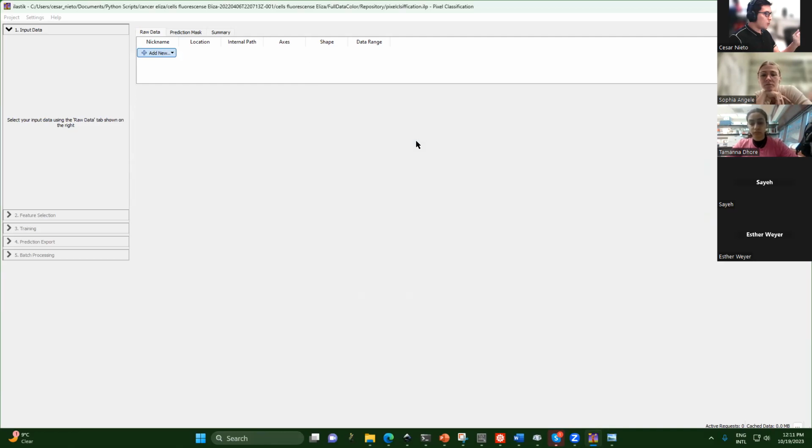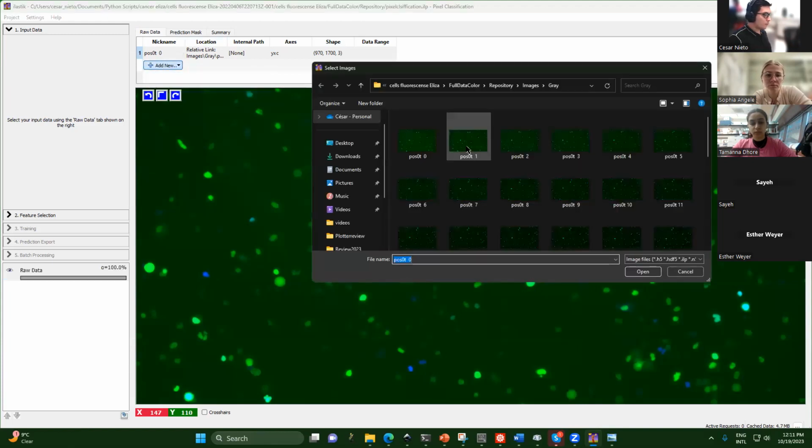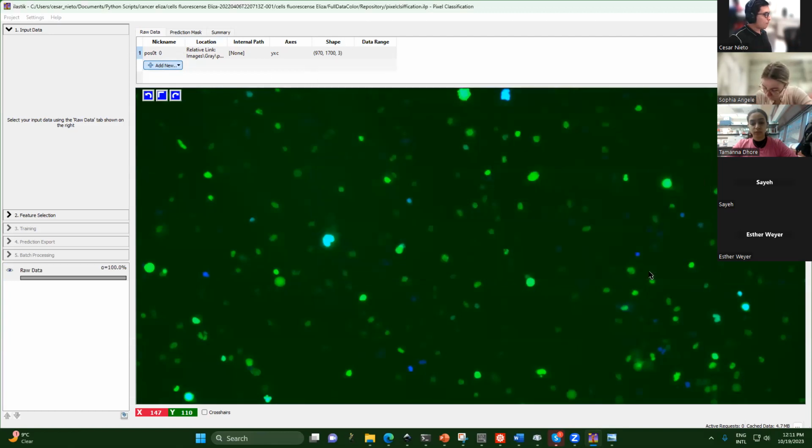Okay, so let's say we open this one, and the program allows you to import it, but I'm going to import all of them. In this case, I uploaded 50.